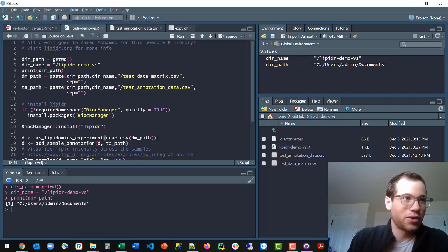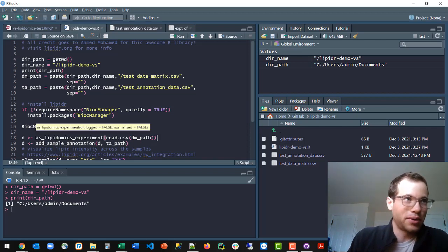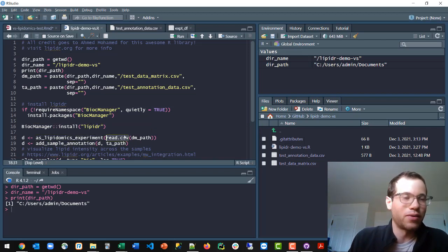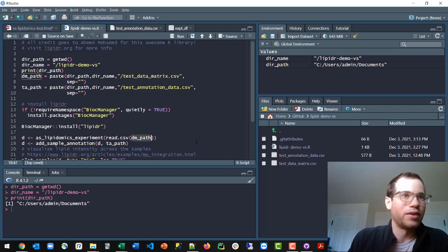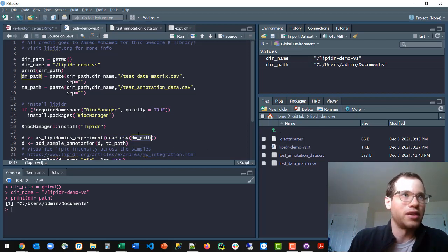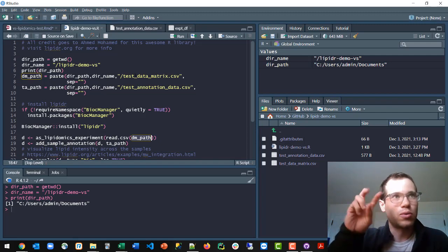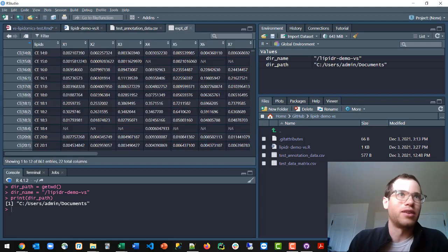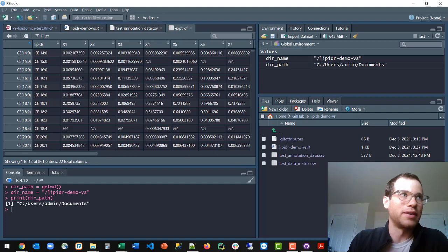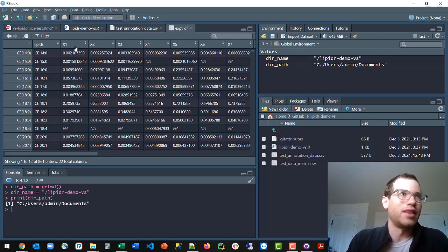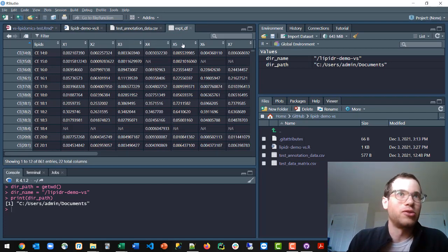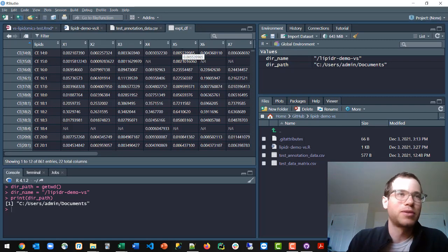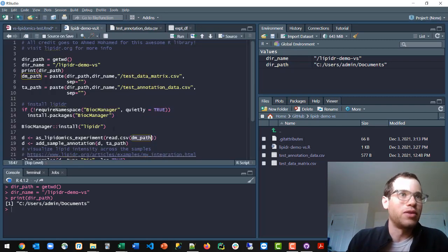And then, finally, what you do, it's pretty simple. You run this command, and you tell it to read in from that CSV, and you reference that CSV's path for the actual quote-unquote data matrix. And that's this guy right here, where you have each row corresponding to a lipid, and then the column corresponds to each sample in your study. So that's what you need.